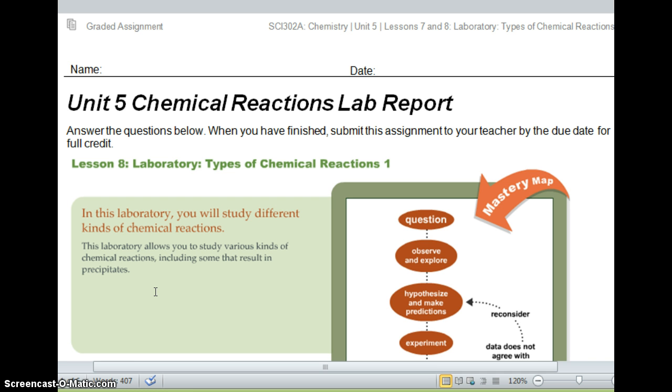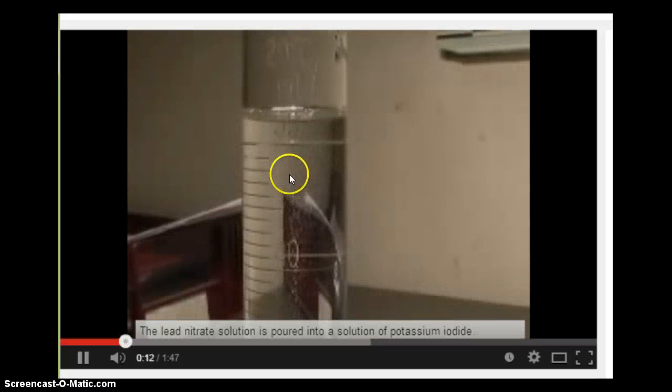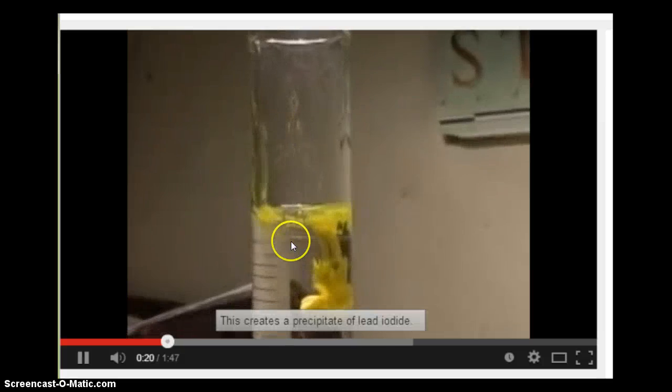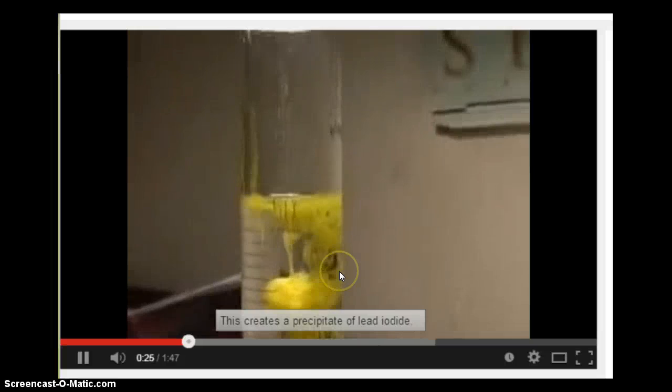A precipitate is when you start with two liquids, you pour them together and they make a solid. That solid is the actual precipitate. Here's a quick example of what a precipitate is. We have clear liquid here, and we're adding some more clear liquid. You can see it dropped down and it was clear, and as soon as it hits, we have a precipitate. We have chunky solids. Look at that.